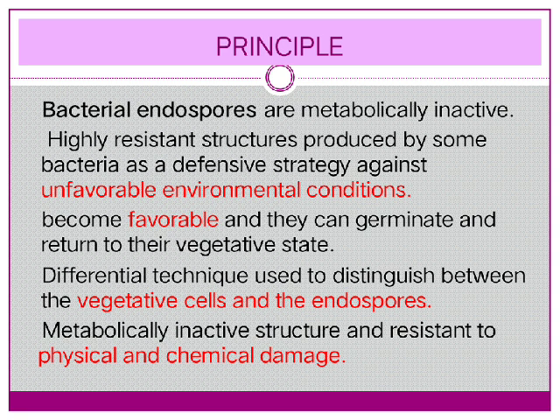Water is used to decolorize the vegetative cells, and it removes unwanted stain. Mordant: use of steamed heat. It is used to force the primary stain malachite green into the spore covering. Safranin acts as the counterstain. Any cells which have been decolorized at the end of staining, the vegetative cells, will be pink, and endospores will be dark green.